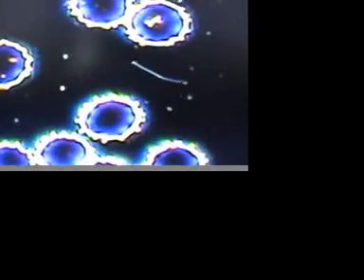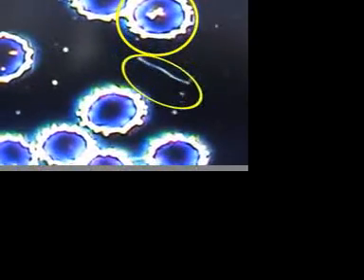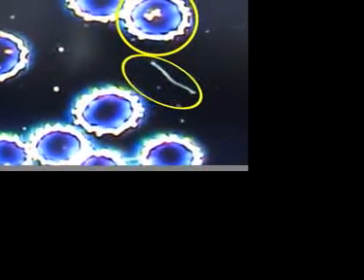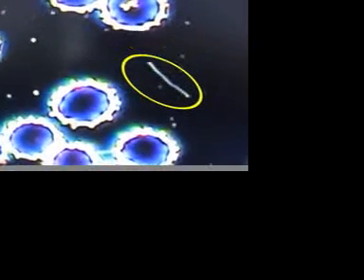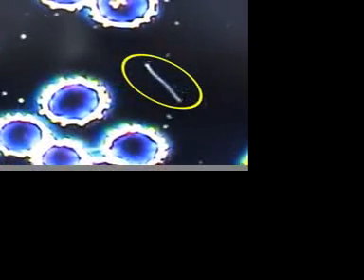On the bottom, a possible Organism X. In the top, this is a Candida or yeast infection. And again, this could be gotten rid of relatively easily with drugs such as Nystatin. The possible Organism X in the bottom, again, just possibility. The Organism X, but most important on the top, the blood cell that seems to have a clump of inclusions or eggs.